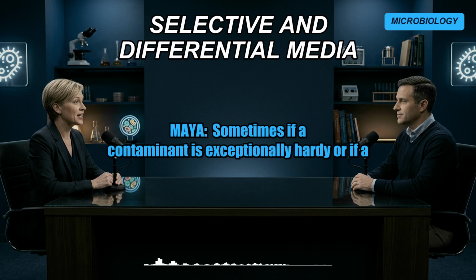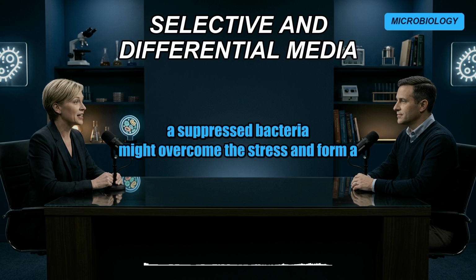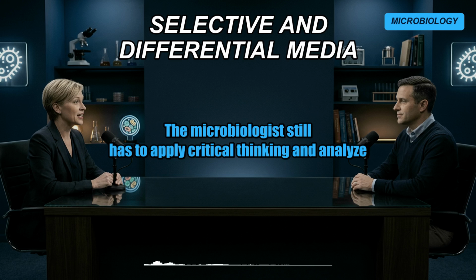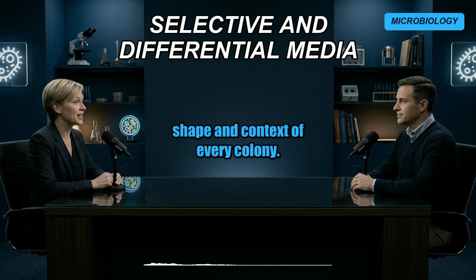Sometimes. If a contaminant is exceptionally hardy, or if a technician leaves the plate in the incubator for 48 hours instead of 24, a suppressed bacteria might overcome the stress and form a tiny, struggling colony. The microbiologist still has to apply critical thinking and analyze the size, shape, and context of every colony.